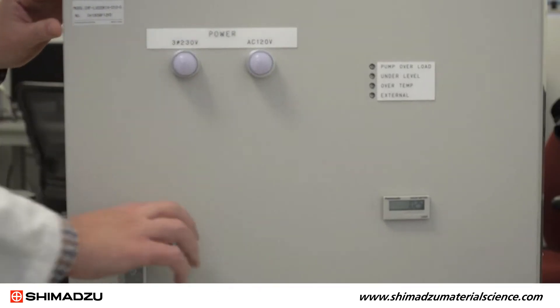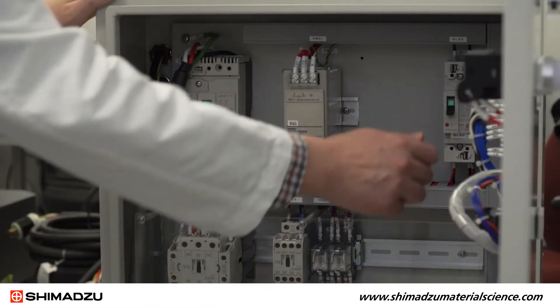First, you need to open the control cabinet and turn on both the single and three-phase breakers.